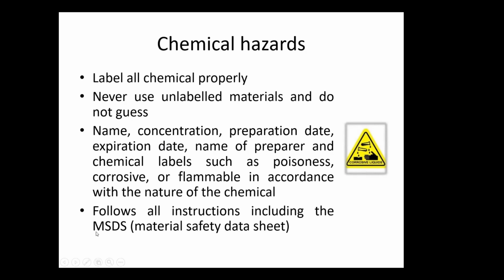And it is a good practice. In my time, I don't know about now, but when I did my degree, the MSDS was not emphasized much. It was only when I was doing my masters that people started talking about the MSDS, the material safety data sheet. So whenever we want to use a material, we put in our lab logbook what material we use and the MSDS. During the degree, all this is assumed to be covered by your lecturer or your lab assistant. But during masters, PhD, and when you are working, it is your own responsibility.